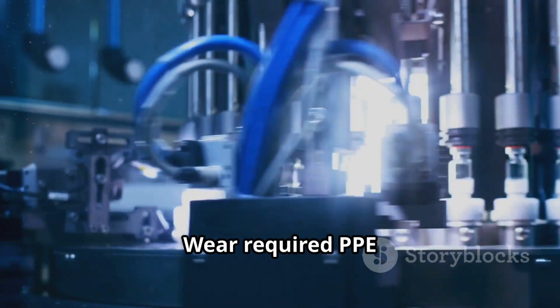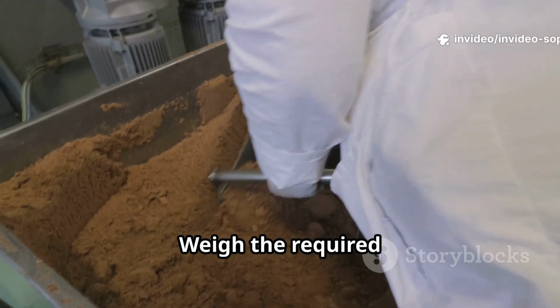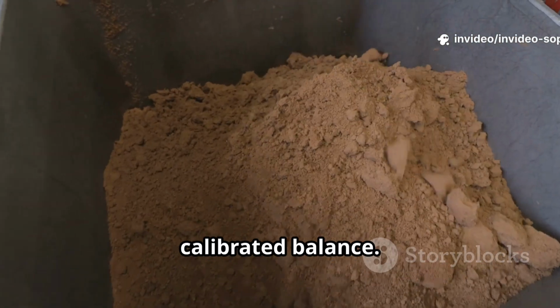Wear required PPE, and conduct a final personal check before opening. Open the container carefully to prevent spillage. Weigh the required quantity using the calibrated balance.